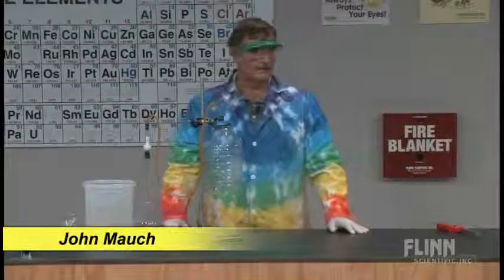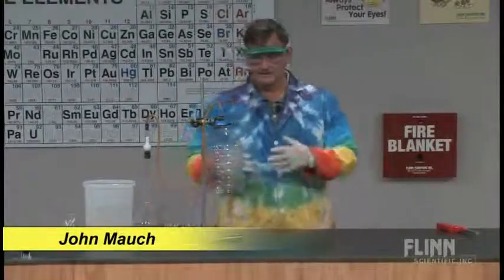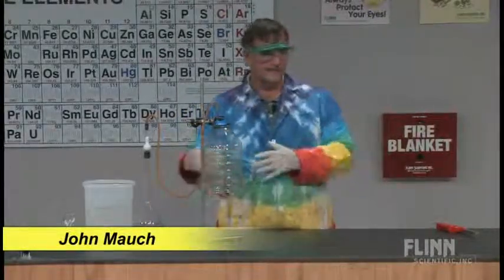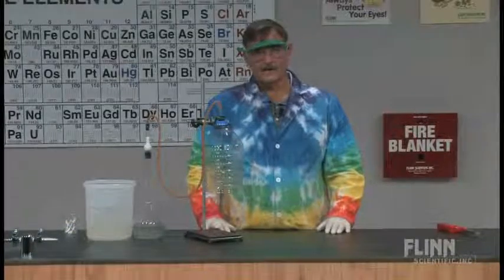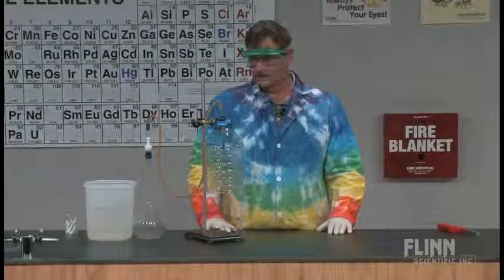Today's demonstration is called the bottomless bottle. I want to give some thoughts on how to set it up, and then once I get it going, I'll talk more about the reaction and the energy relationships that occur in this particular reaction.